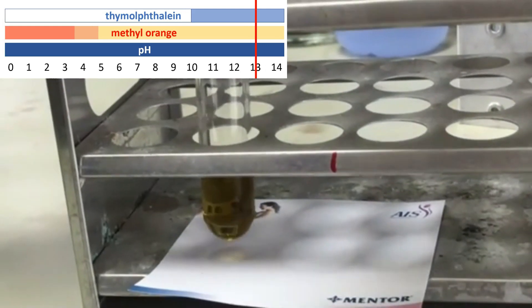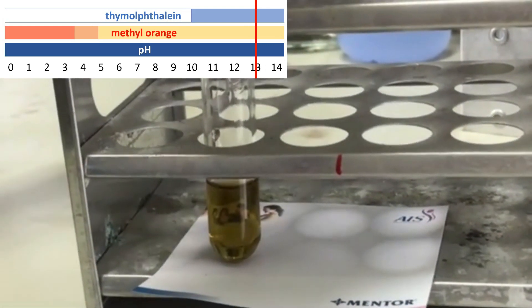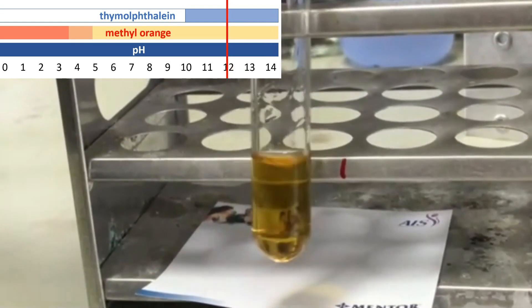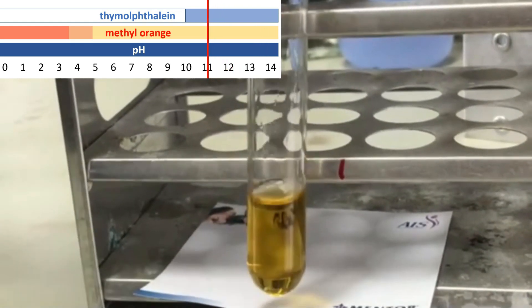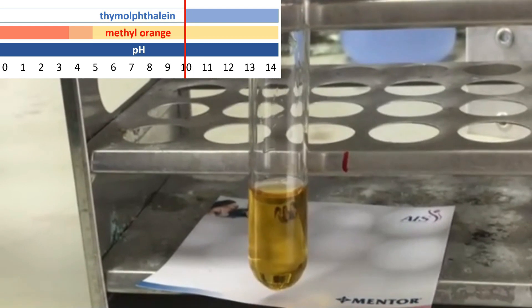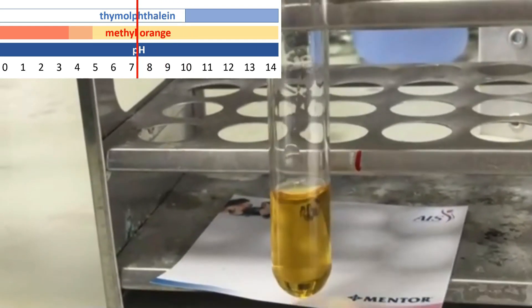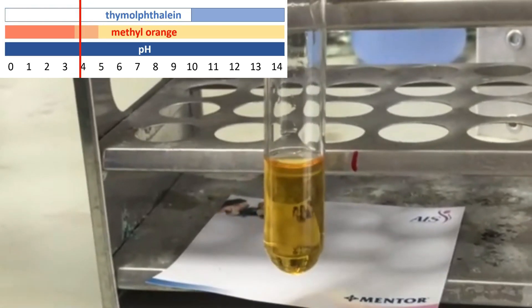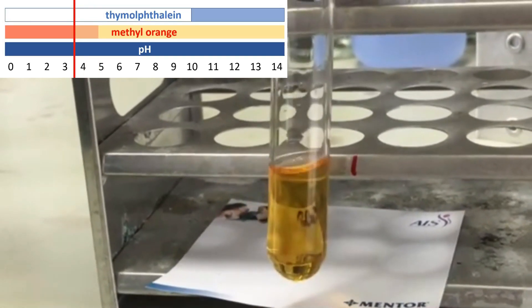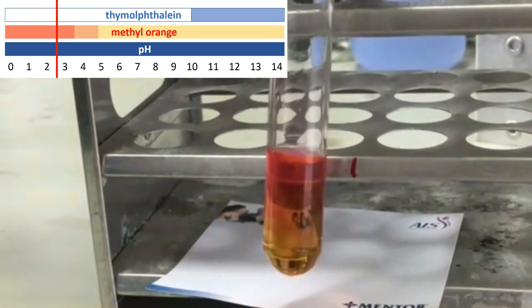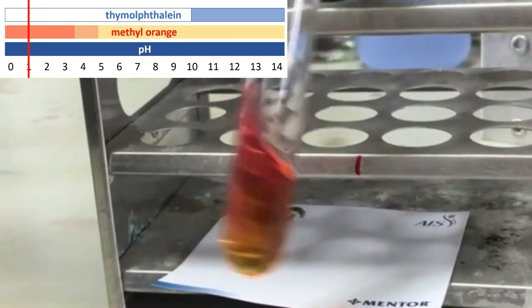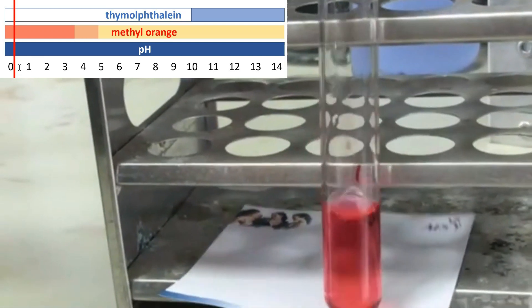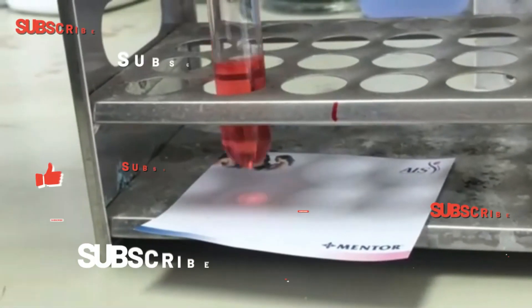As nitric acid is added, the solution begins to turn to yellow, and then orange, and finally red or pink.